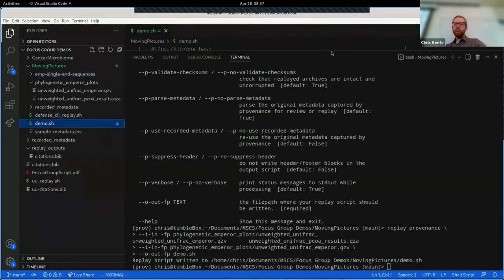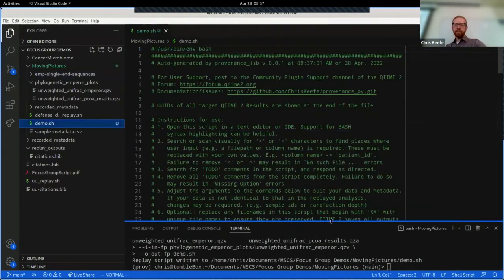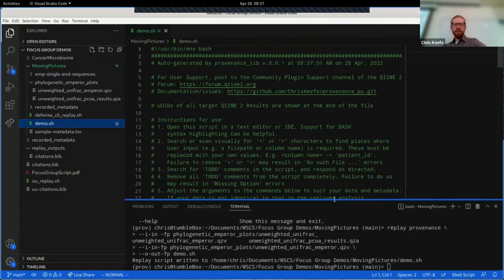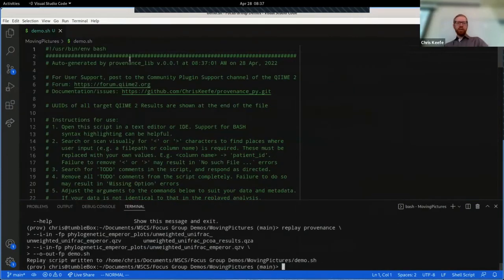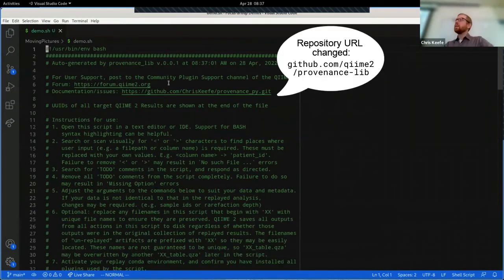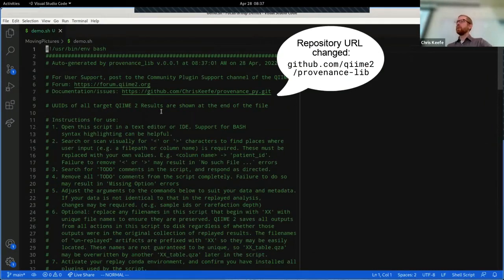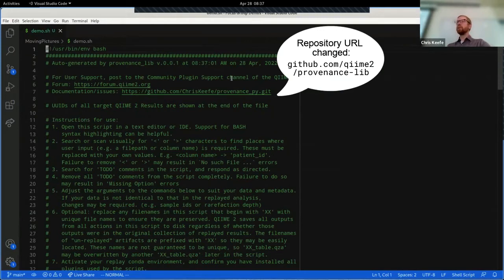We'll open that guy up. And the first thing that I notice is there's like a whole bunch of green comment text here. The idea is that the outputs of provenance replay should be self-documenting so that a user who just gets handed these outputs still knows what to do with them.